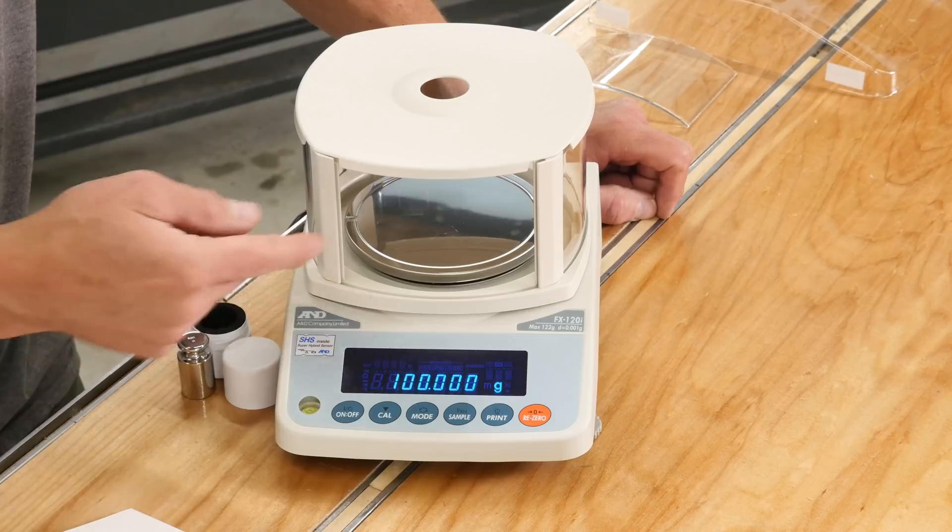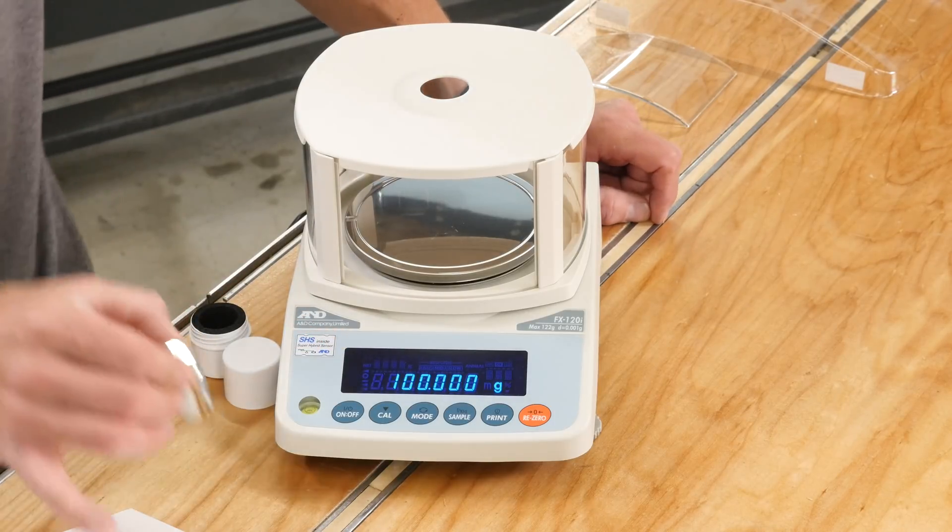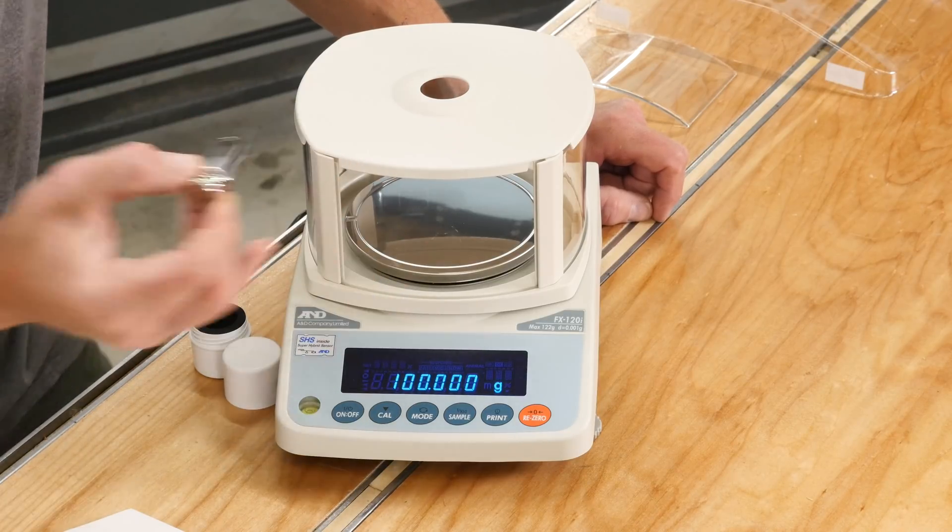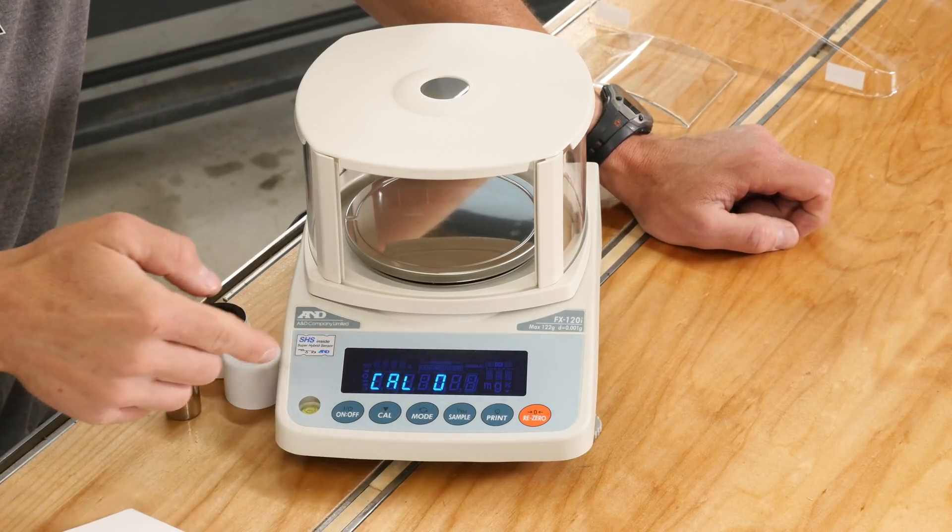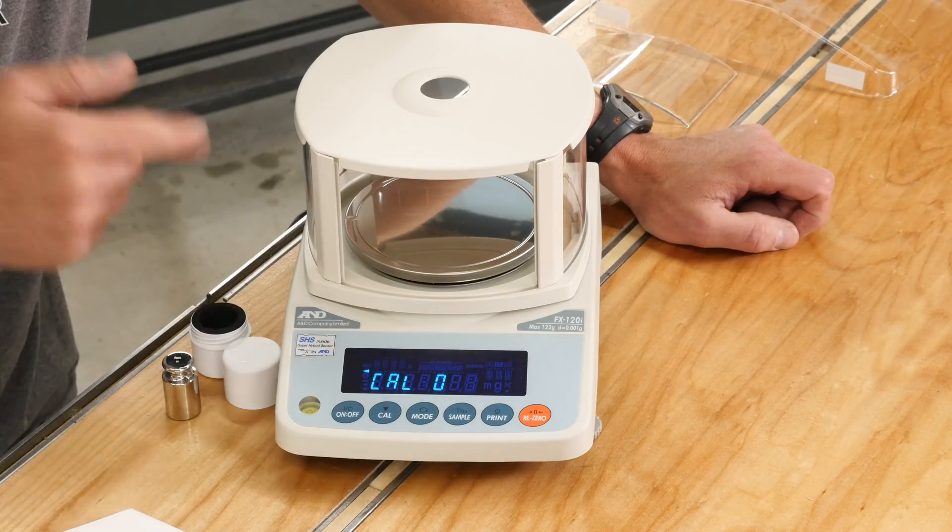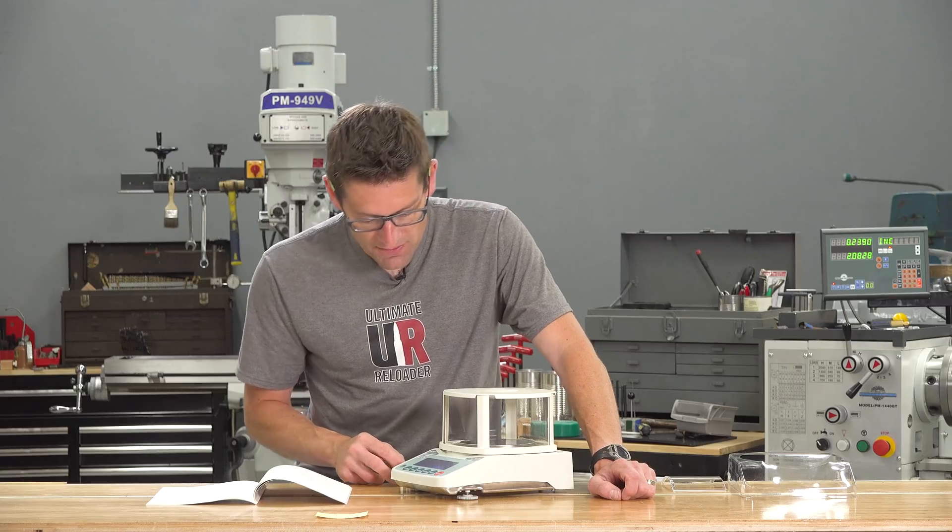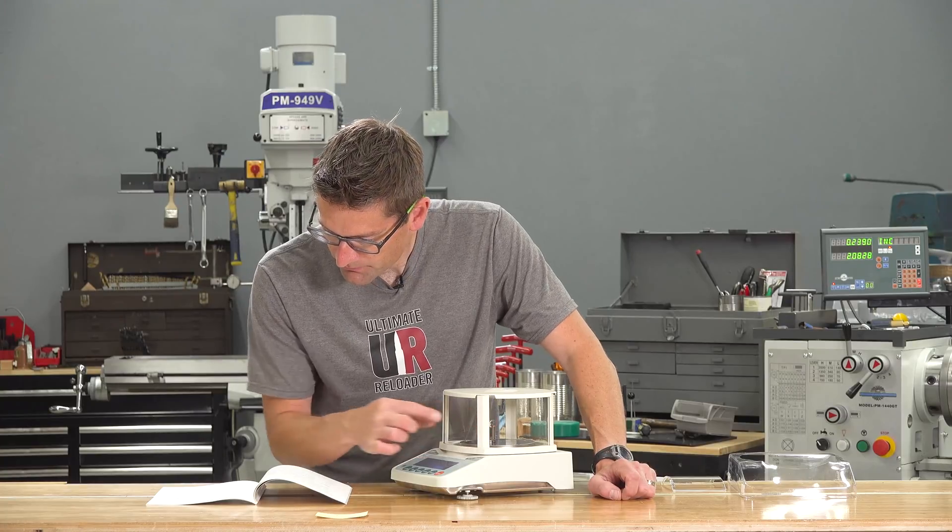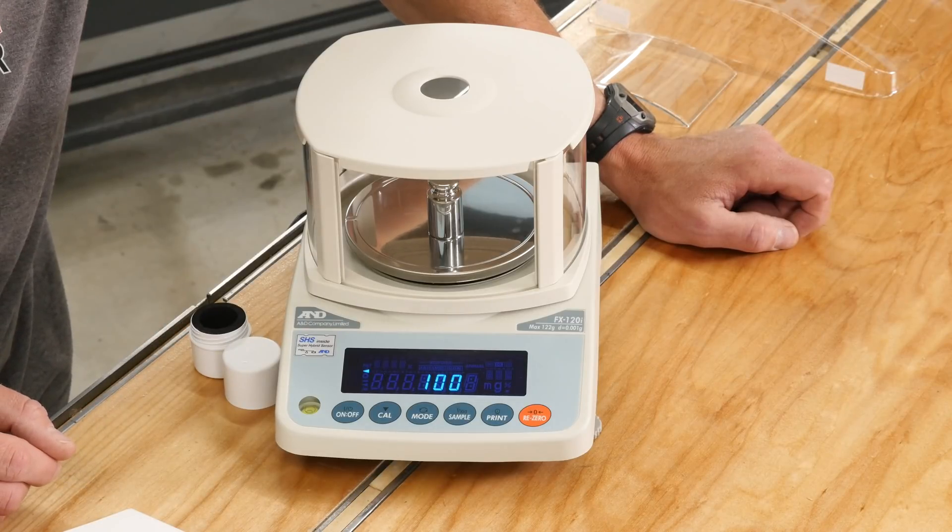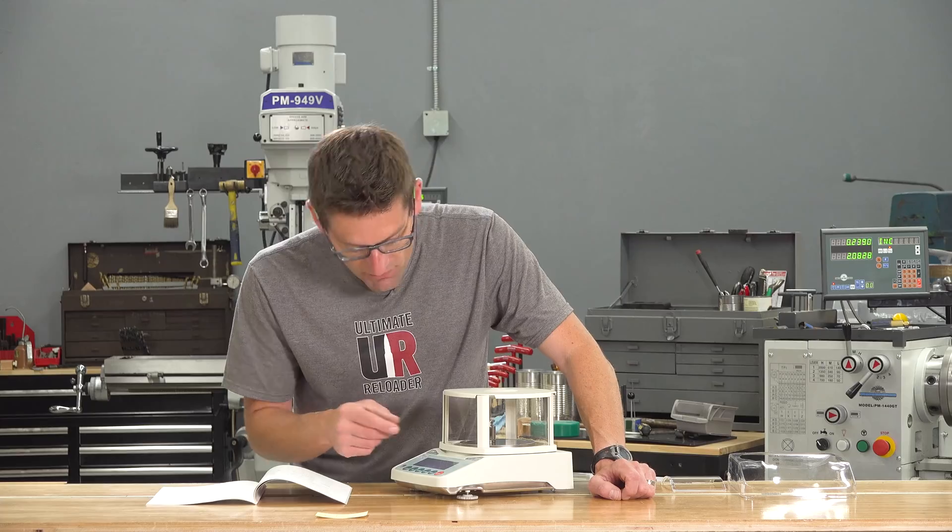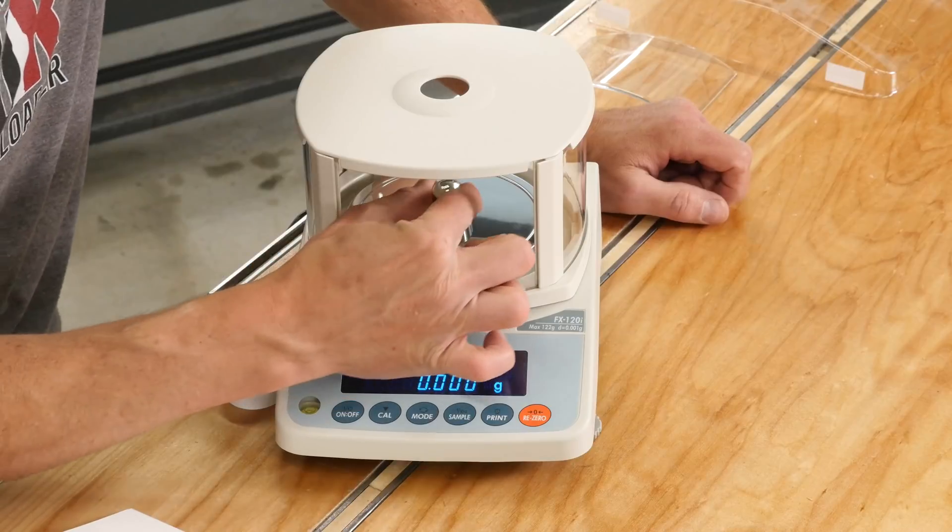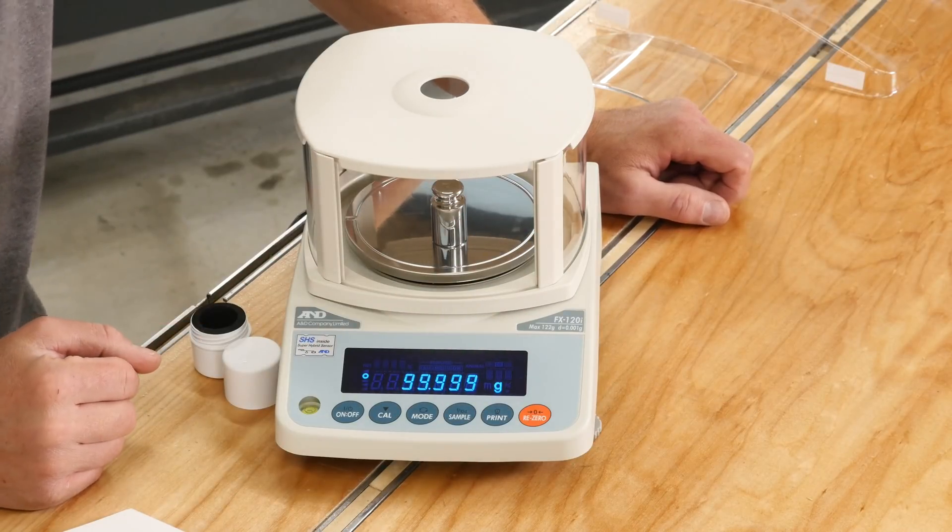Now we can actually hit sample here and it'll show us what our reference weight is. And we can use different keys to increment or decrement that weight depending on which type of reference weight we have. This is 100 gram. We have 100 gram displayed. So if we hit print, it will exit that. We hit print one more time with nothing on the scale, and then it stores that zero point calibration. Now it says 100, so we're going to put 100 on the scale. Then we hit print. And when it says end, we can take the calibration weight off the scale. Now we're back at zero. And if we put the weight back on, we should come to 100.000. And there we go.